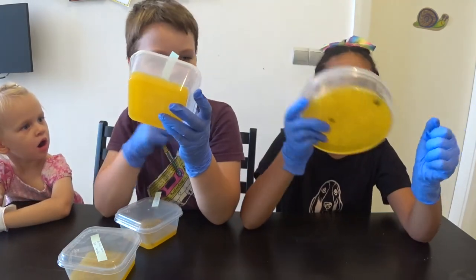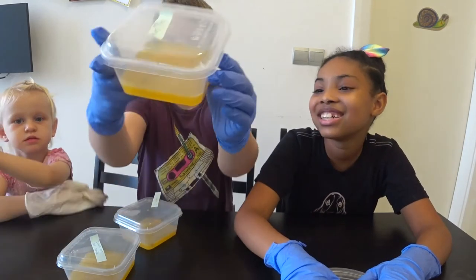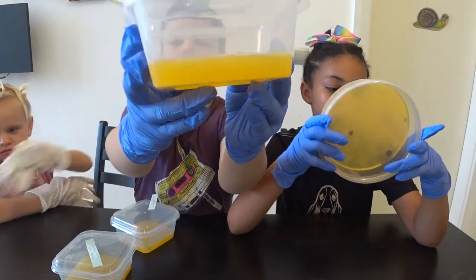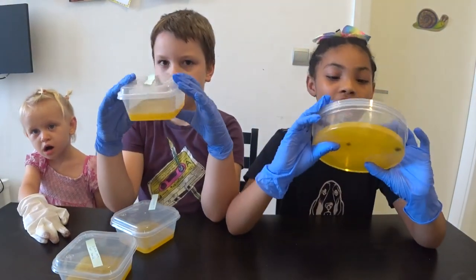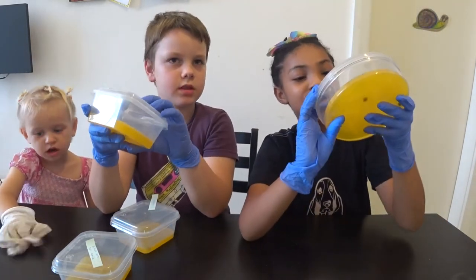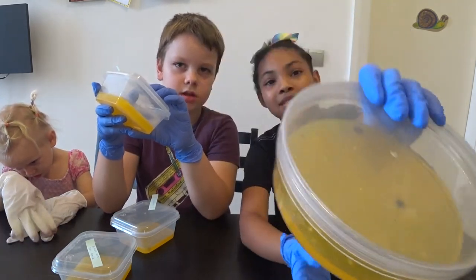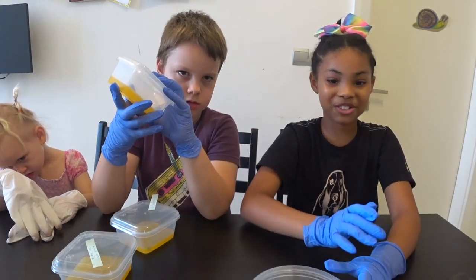Oh my god, look at the spots. You see bubble spots and cat fur, you can see it like this. Actually, this one, I also forgot to mention, it has some white thing that looks like paint spread inside. This one is a handprint, one of all these things that touch and put the fingers.